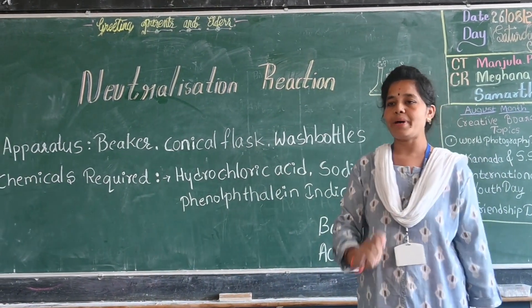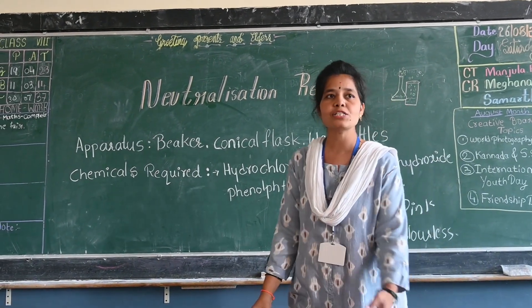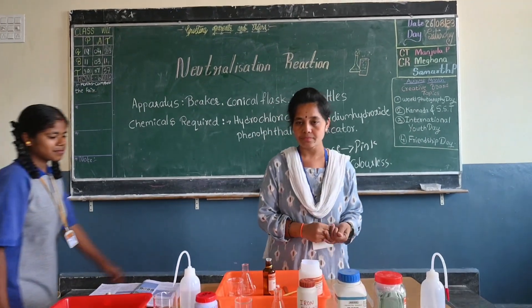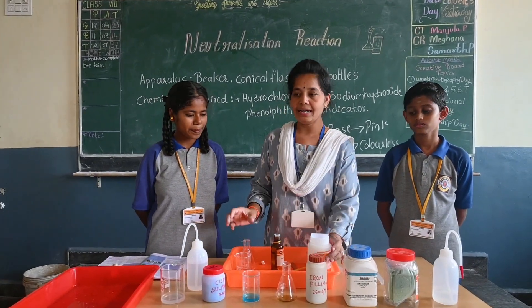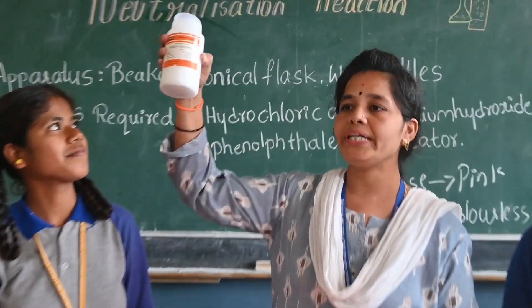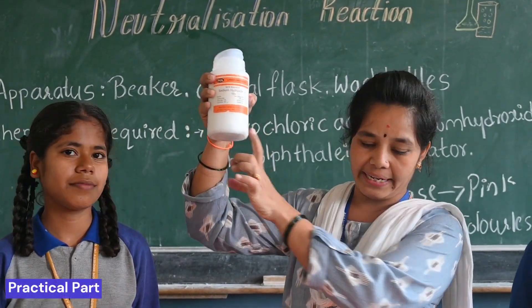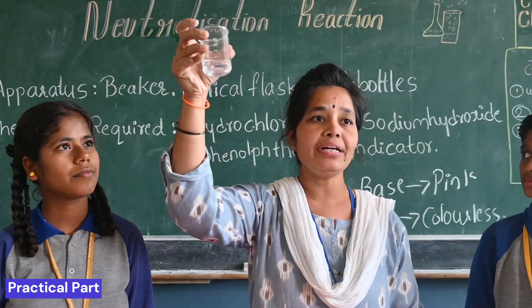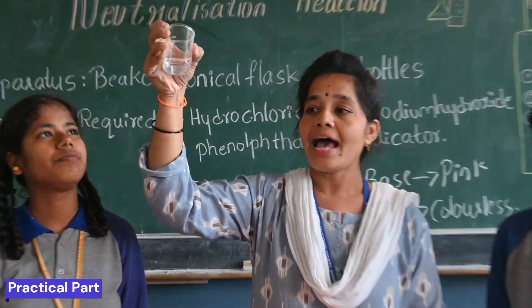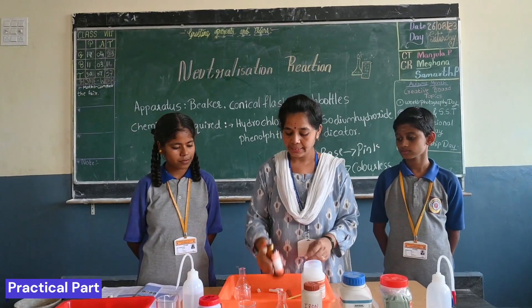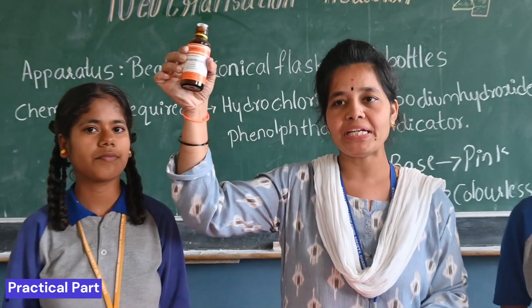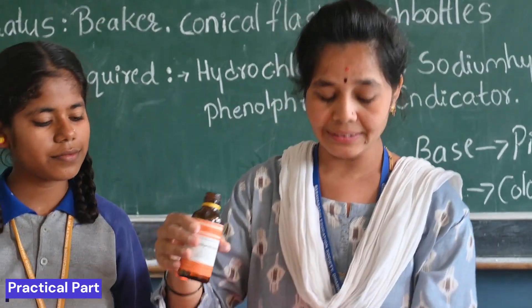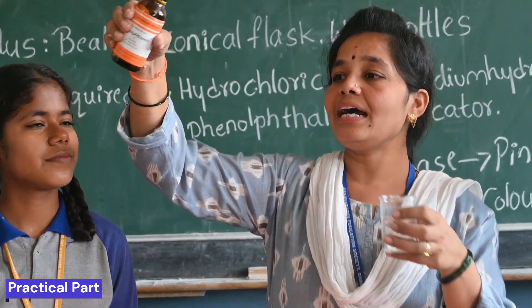Let us confirm this through an experiment. Come here. This is sodium hydroxide — it is a base. And this is hydrochloric acid. And this is phenolphthalein indicator. It is basically colorless — you can see the color of the phenolphthalein is colorless.